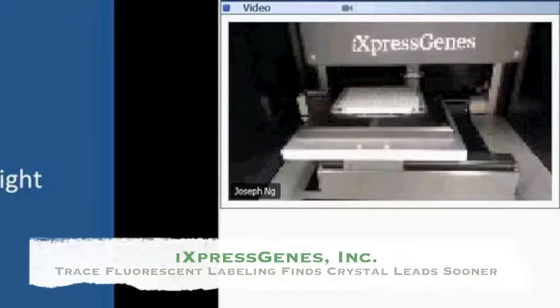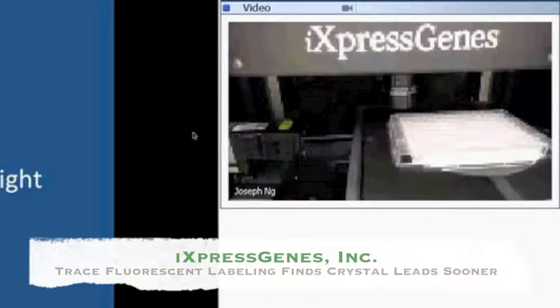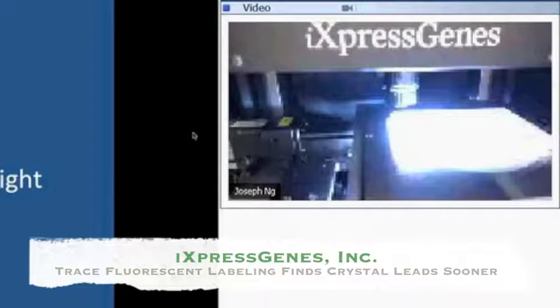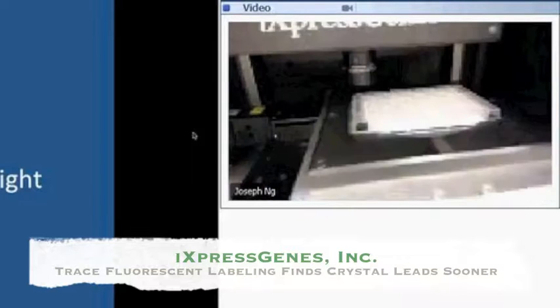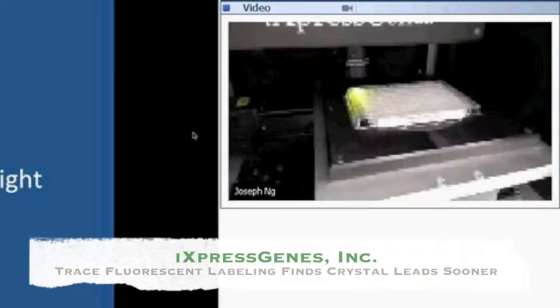And this has a fluorescent label on the proteins. So if, Mark, you could turn on the instrument, this actually shows you what it starts out looking for. It'll show you a white light capture, followed by a green light, and then these excitation wavelengths will allow you to look at different types of single crystals that may arise very early on that you would not normally detect otherwise from a light microscope.